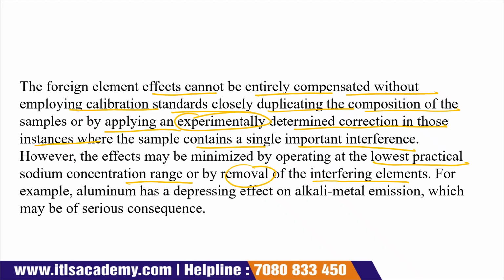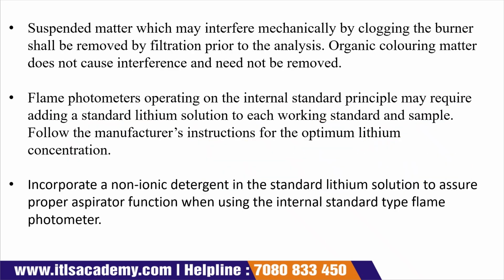Now, come to the next slide. Suspended matter which may interfere mechanically by clogging the burner shall be removed by filtration prior to the analysis. So there is a lot of suspended matter present which interferes mechanically. How do they interfere?